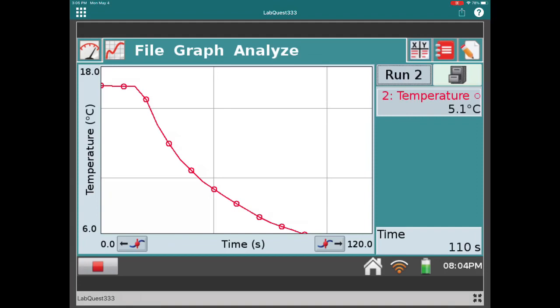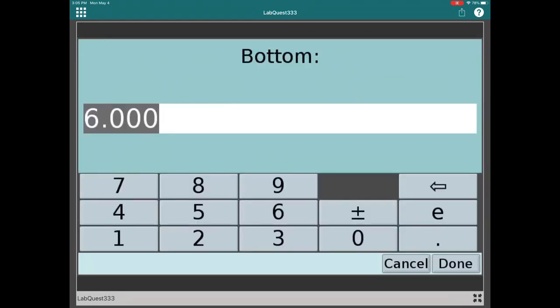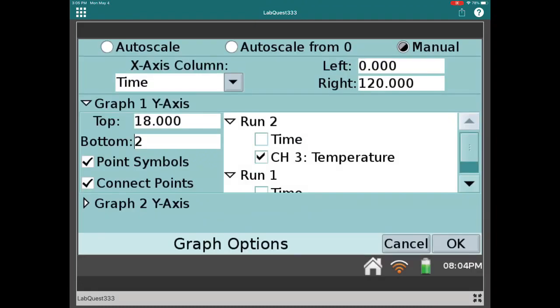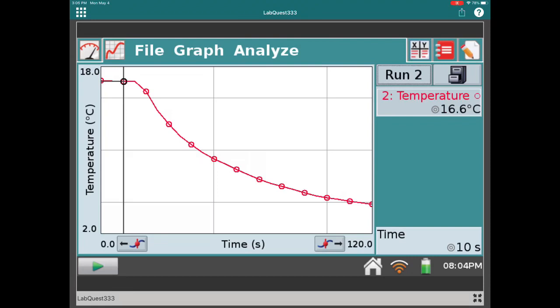At about 110 seconds, we're ready to wrap up. I'm going to have to rescale the graph so we can see the entire curve. Data collection has stopped, so let's press the graph icon at the top, go to options, and change the lower number from 6 degrees Celsius to a smaller number to display the entire graph. Now you can see the entire cooling curve from 0 to 120 seconds. Clicking on the last data point gives your final temperature. Clicking on an early data point at the beginning gives the initial temperature of the methanol. Now you can calculate delta T.